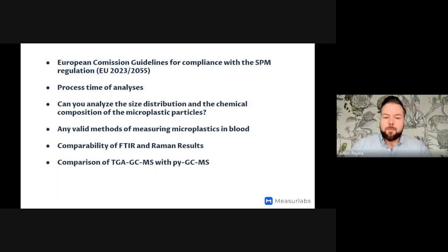And this method makes it easier to do the quantification than in TGA. TGA GCMS is not usually used for quantification and only for qualitative analysis in our experience.